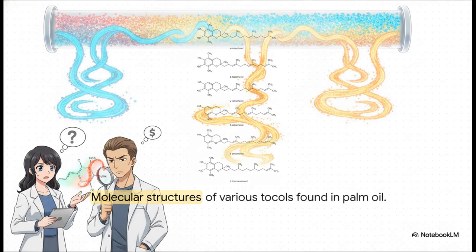In fact, the Malaysian Palm Oil Board notes that because these components are so stubbornly hard to separate to a clear baseline, different laboratories end up getting completely different results. And that discrepancy leads to huge international trade disputes over the volume and price of these extracts. We desperately need a technique that can reliably tell these chemical twins apart.